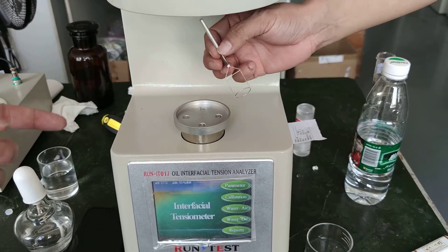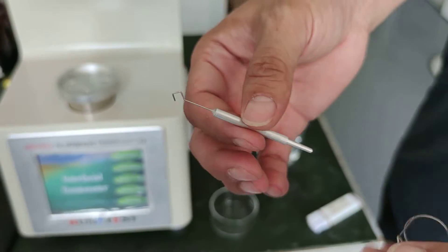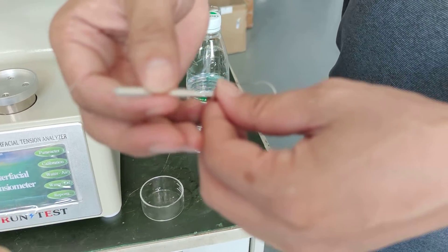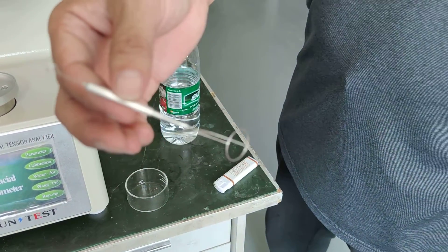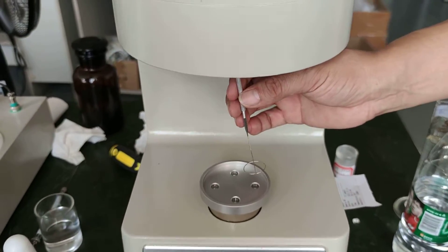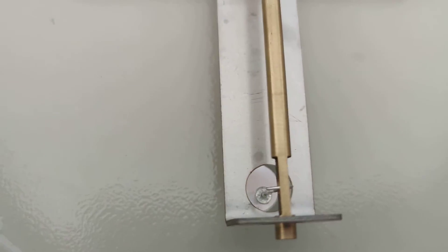Here is a platinum ring. Just connect it with the front pendant and hang it on here.